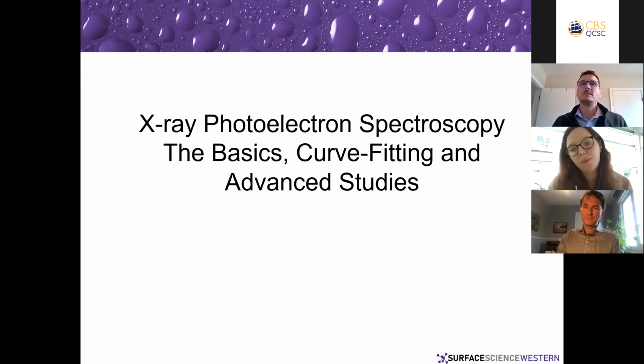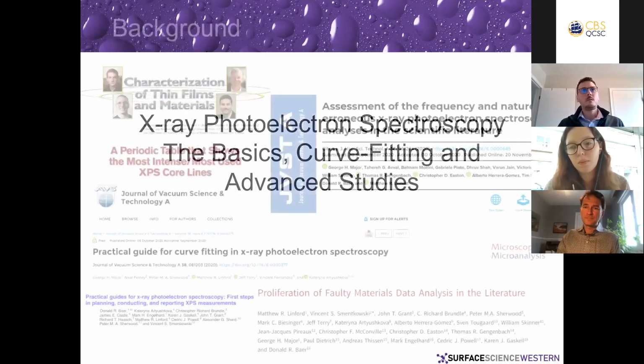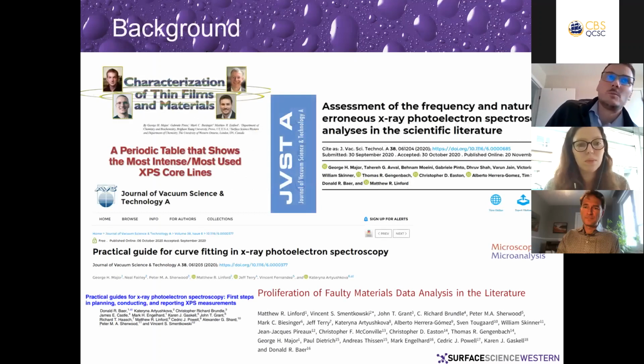So XPS, I'm going to go through some of the basics, a little bit about curve fitting, and then some of the more advanced work that we've done. Some of the background for some of this work: over the years, myself and others have noted issues within the literature with interpretation of XPS spectra, in particular the interpretation of transition metal XPS.